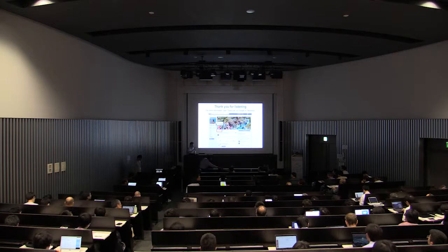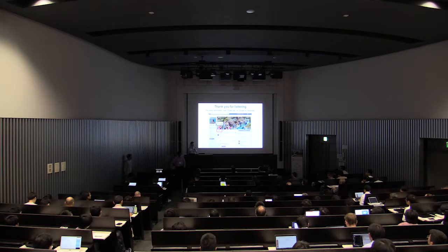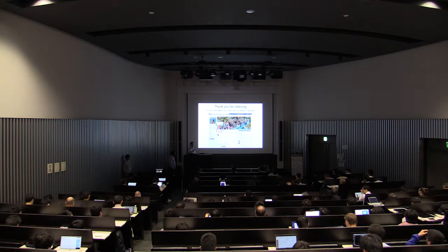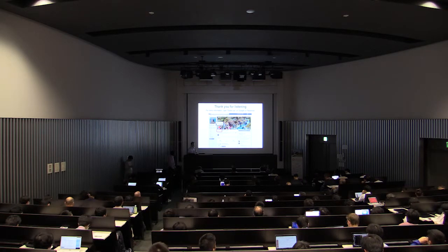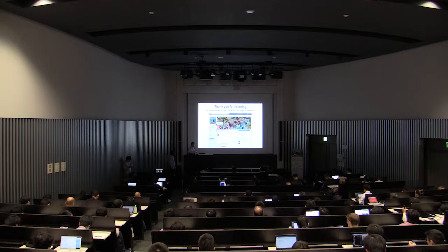Srinivas: Quick question, mostly for clarification. If you want to increase the throughput, instead of having just a single file of cells going by, are there ways to look at clusters of cells heterogeneously and then have a more complex sorting mechanism? Because images can be captured in parallel, right? It doesn't have to be a single cell. Yeah, single cells and clusters also, yes. Right now I see that it's a single file, right? One cell behind each other.